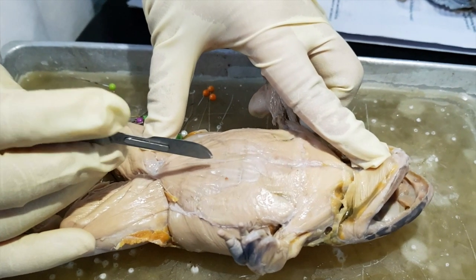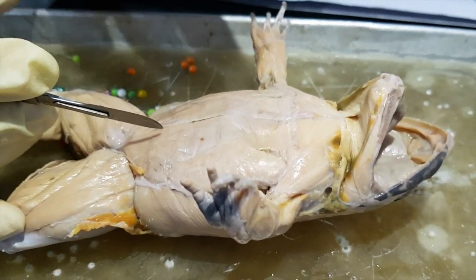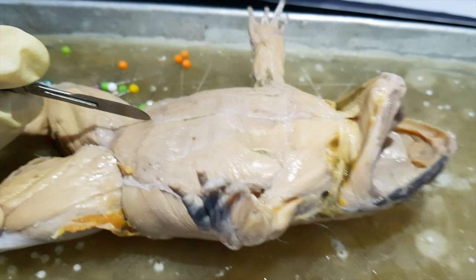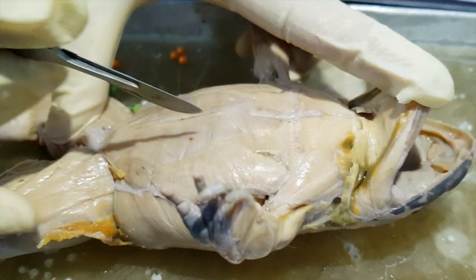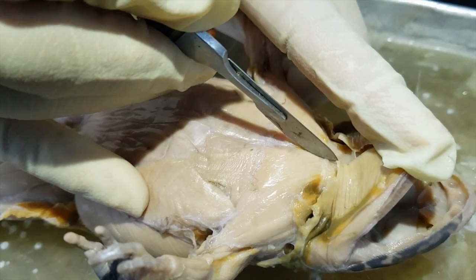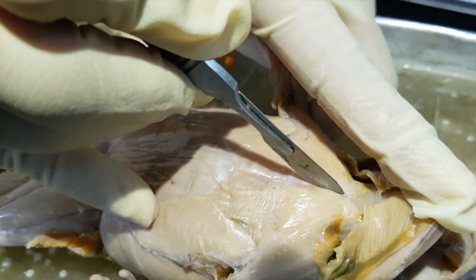We're going to study now the internal organs. So the internal organs will include organ systems for digestion, for respiration, for urogenital, as well as for circulatory. So you can just make a slit on the ventral portion starting from the jaw area downwards.